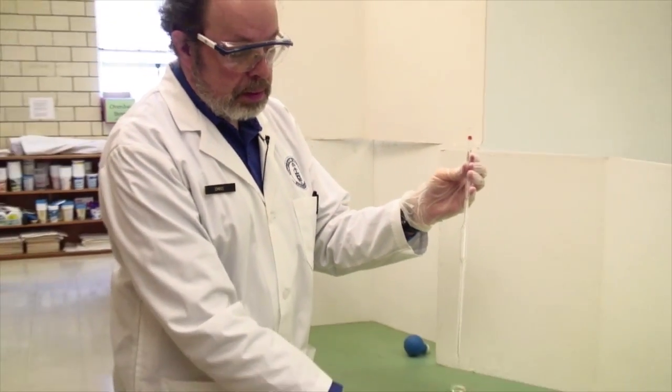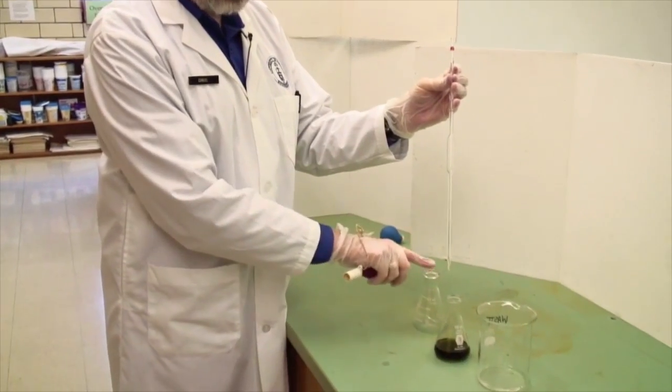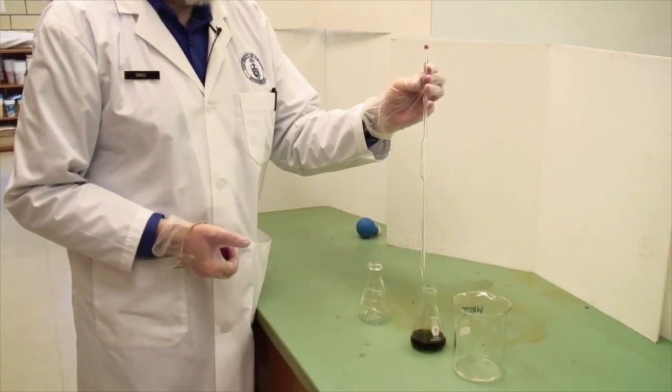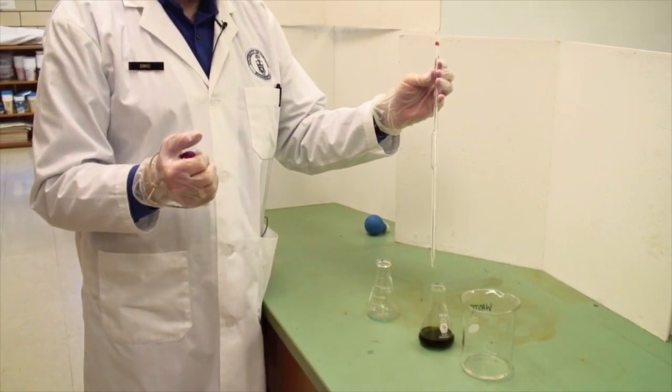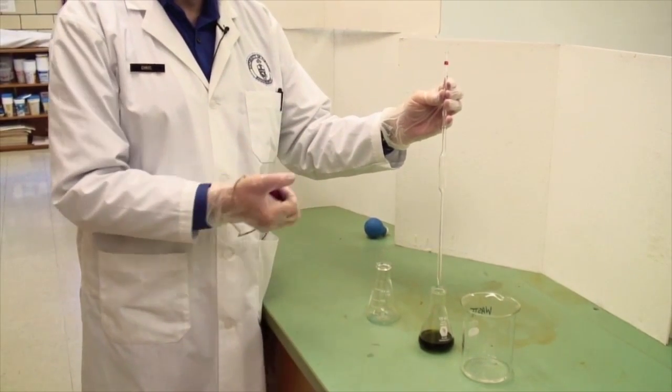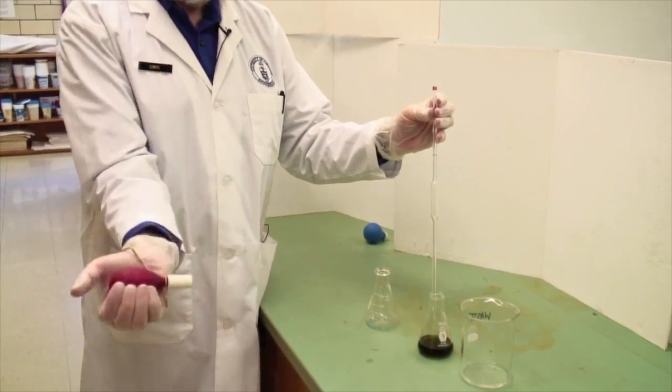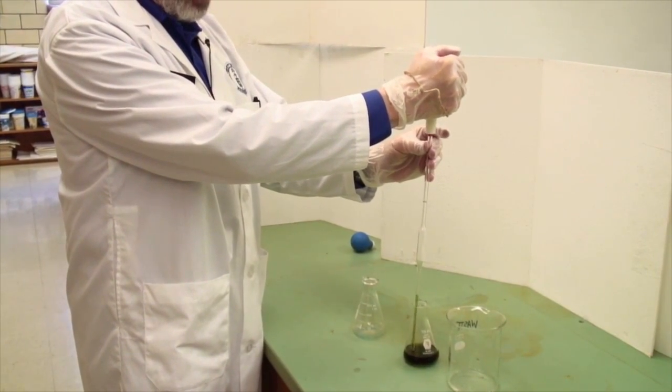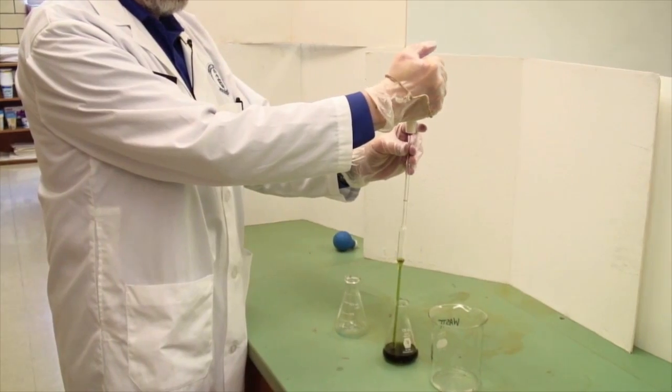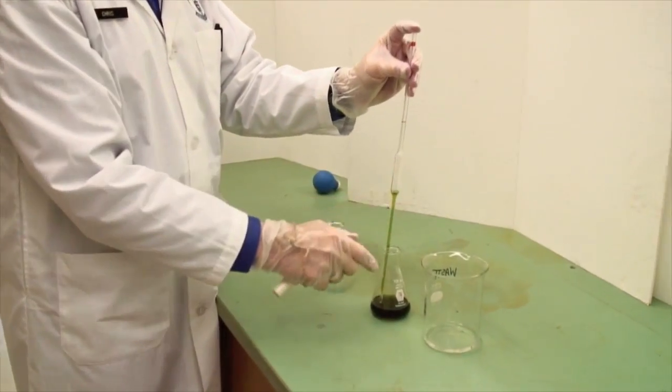I'm going to be dispensing this green liquid into this empty container, 10 milliliters of it. The first thing to do is wash the pipette with whatever this liquid is, because who knows what's in there right now. Flatten the pipette bulb and apply suction to get some liquid inside.